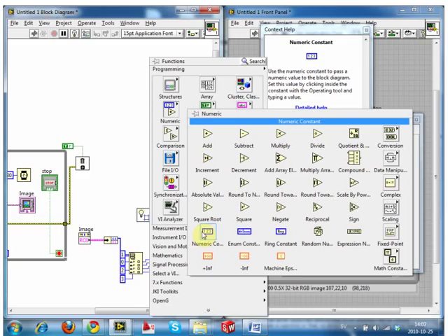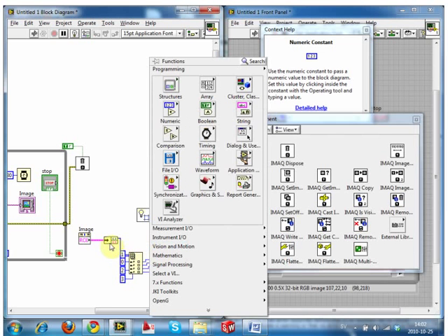Even if you drew a pentagon, let's say you had a nice big pentagon, the rectangle would fit the edges of the pentagon. So you'd still need 4 constants. If you had some wacky, funky shape and you asked for the global rectangle for that, it would be that. If you wanted to pull out this information from a funky shape, you have to pull it out from the more complex one. So you have to open this one up, then pull out all of the data points individually. The only thing that you get with this first one is the very outer border of the region of interest.